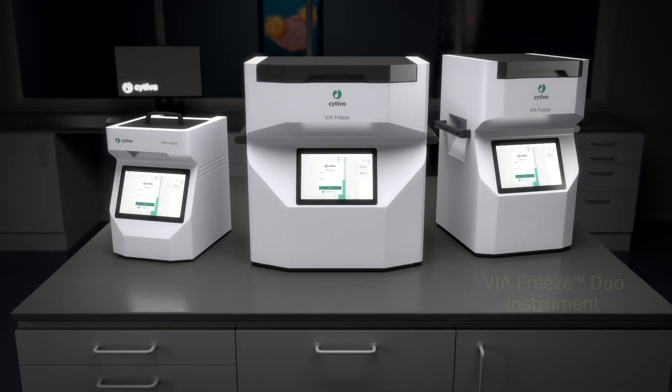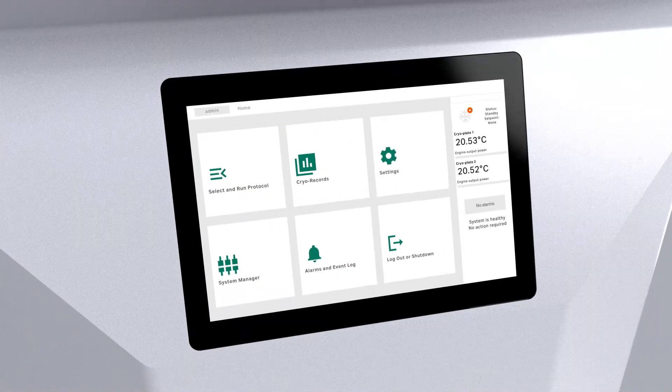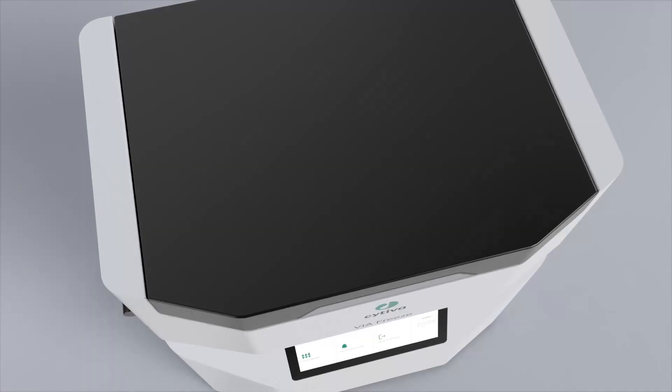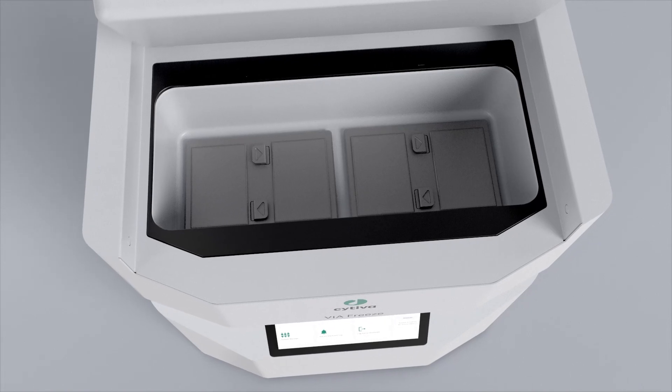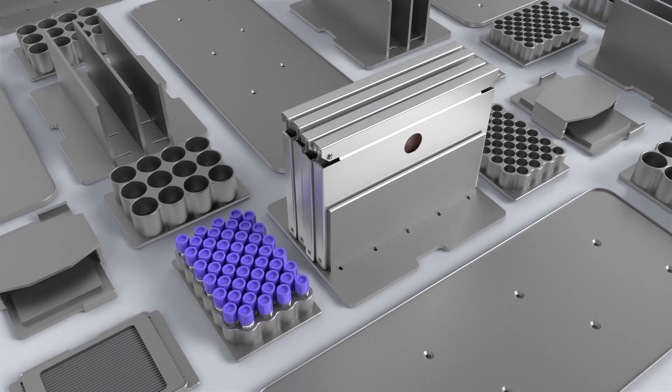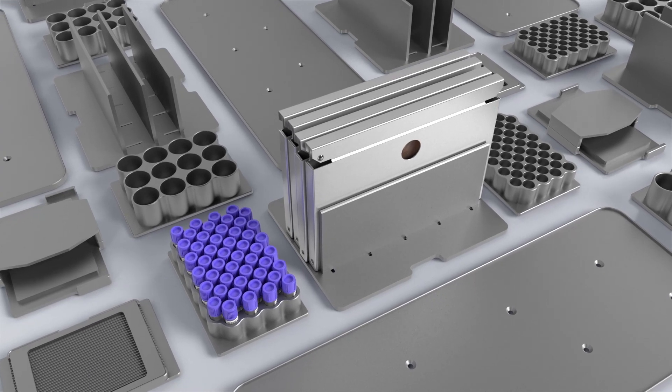The main features of the ViaFreeze instruments include a touchscreen user interface with customizable freezing profiles and a cold chamber with sample plate mounts inside. The interchangeable aluminum sample plates let you freeze a range of cryovials, cryobags, and straws.